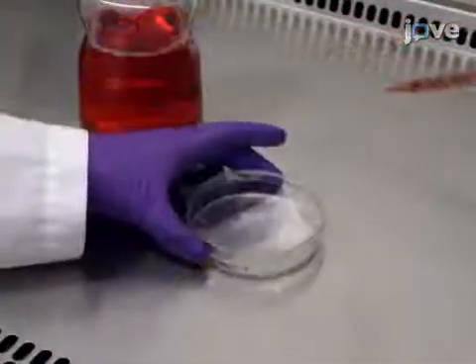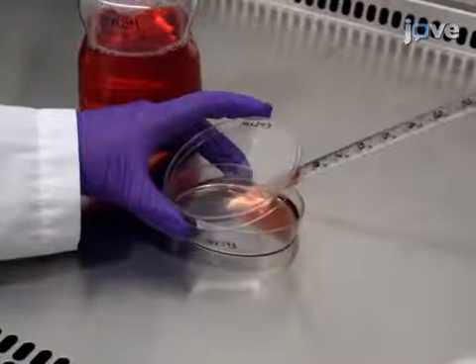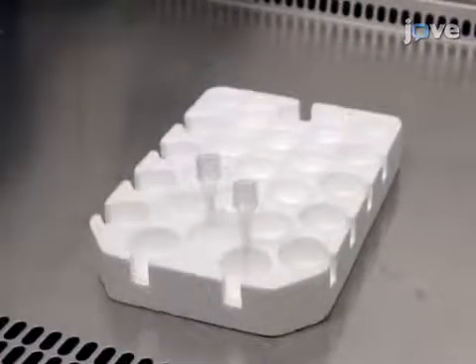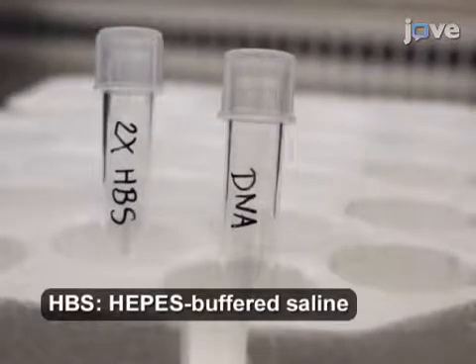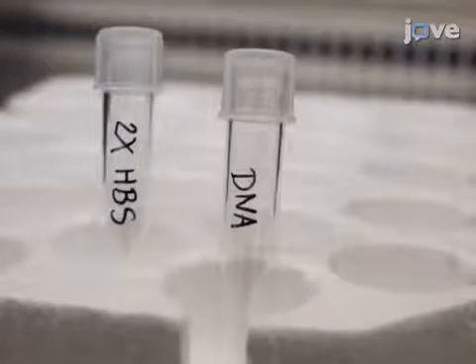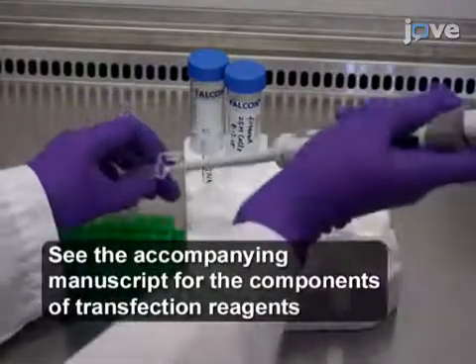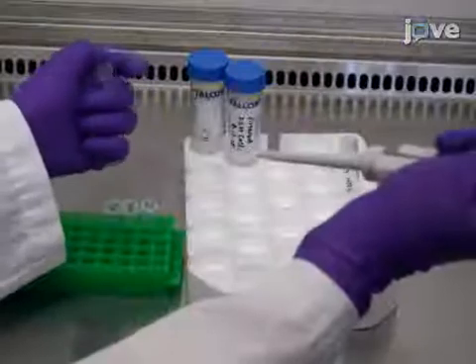On day 5, change the media 2 hours prior to transfection and ensure that there is exactly 10 milliliters of media in the 10-centimeter plate. Next, prepare the transfection reagents for two dishes using two 5-milliliter round bottom polystyrene tubes. Label the first tube as DNA and the second tube as 2xHBS. Then adjust the DNA concentration to 1 microgram per microliter in Tris EDTA at pH 7.4. To make transfection reagents for lentiviruses and retroviruses, slowly add the required components to the tube labeled DNA while continuously tapping on the tube to mix.